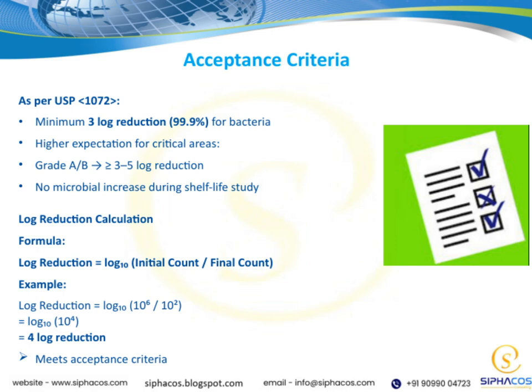Additionally, it's essential that there is no microbial increase during the shelf life study. This ensures that the product remains safe and effective throughout its intended storage period.